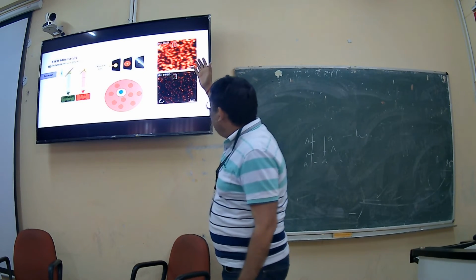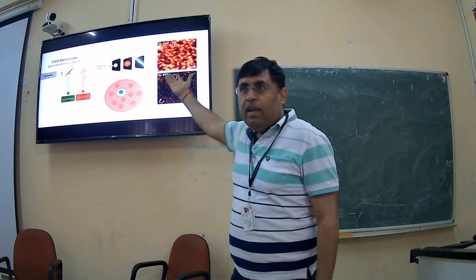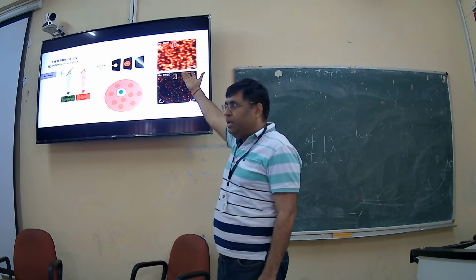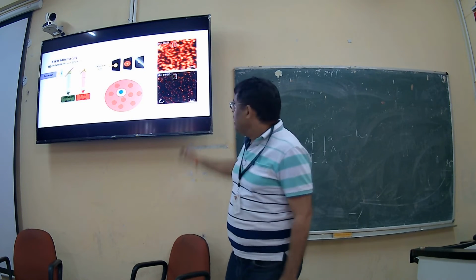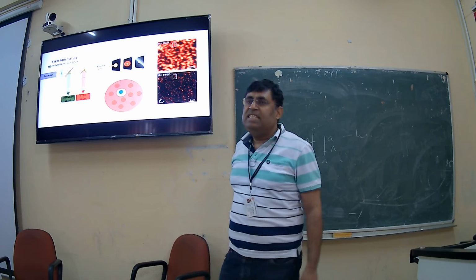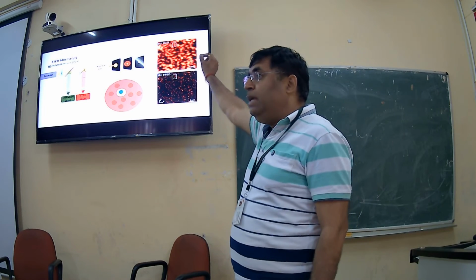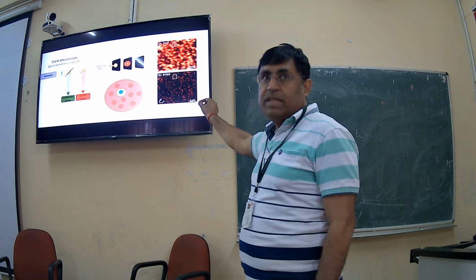So this first one is a confocal microscope, where they are also fluorescing, but see the resolution. You cannot see the difference in this one. But with the super resolution microscope, each can be separated easily. You can even count the points. In the upper one, you cannot count any signal or any point. Here you can count everything, you can quantitate.